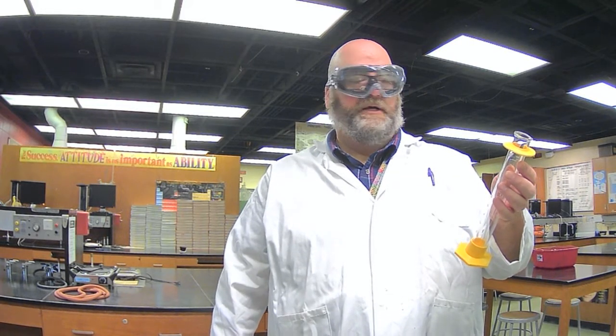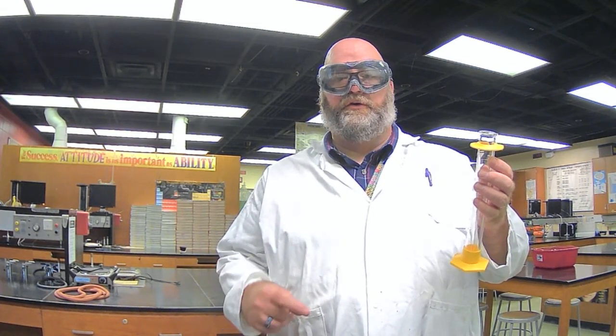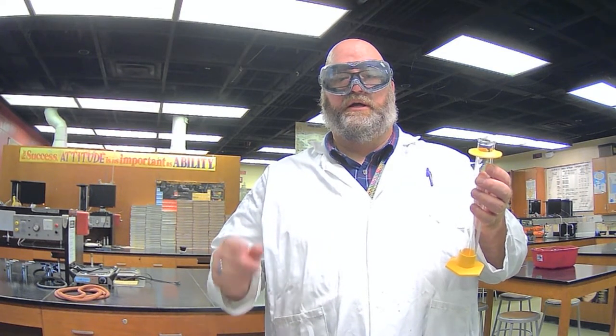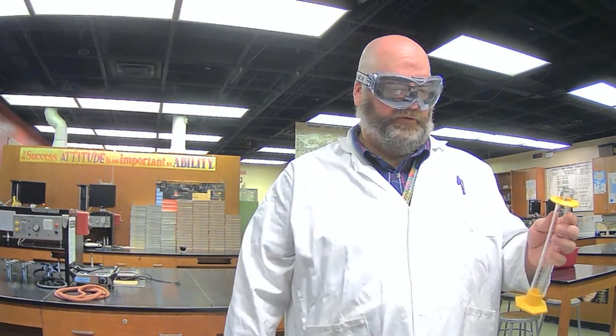It's a 100 milliliter graduated cylinder. Each tick mark on here is 1 milliliter. Therefore we can go to a single decimal place with this. We can go to the tenths place, because we know to a milliliter accuracy, so with the additional digit that we need for that estimated digit, it's going to be a 1 decimal measurement.